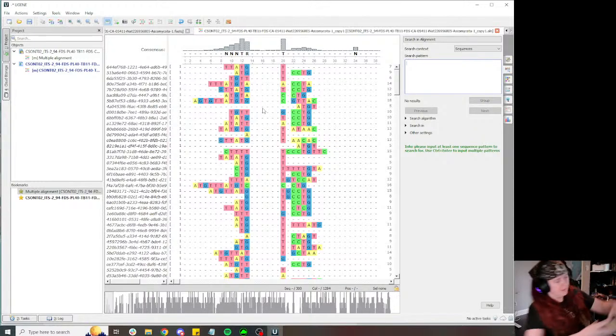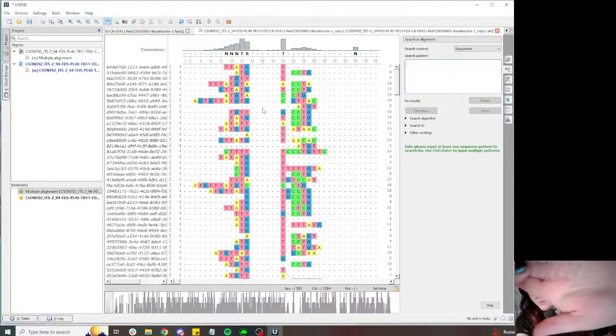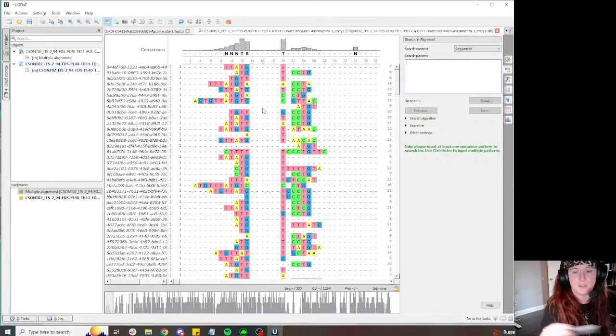Ah, here we go. Okay, so these are the plates we use for sequencing. Each one of these plate wells is a fungi sample, and then we'll do like 5 to 10 of these a run, depending. Versus Sanger where it's one at a time. And you probably can't even see it. The samples we take are so tiny, they fit on the head of a pin.